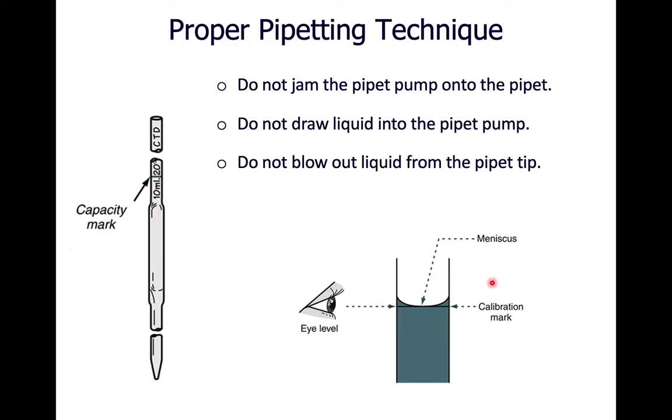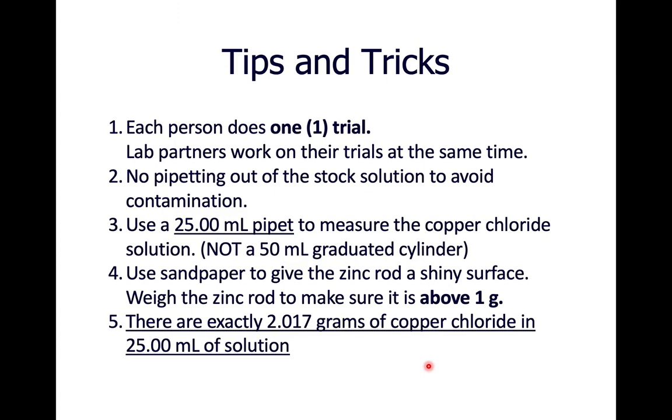This also is showing you that you want the meniscus, the bottom of this curve, to be right on the line. You want to be level with the line when you're looking at it. You would have had the liquid somewhere up here above it, drip, drip, drip, until you're happy and you've got it right at the line. Then you transfer it over to where you want it to be and let it all come out and leave that one drop in the end.